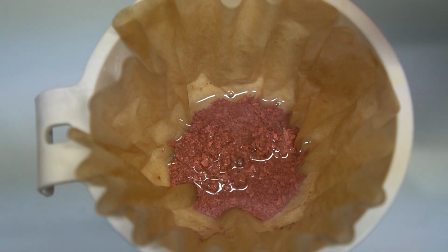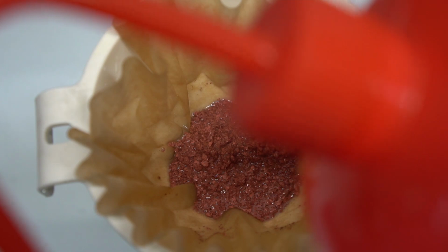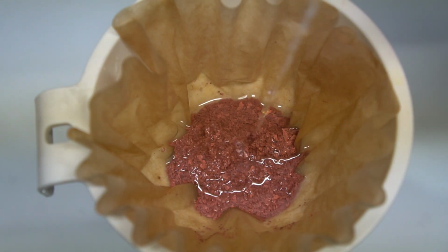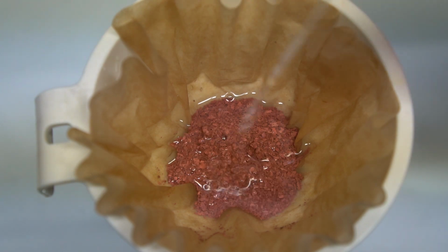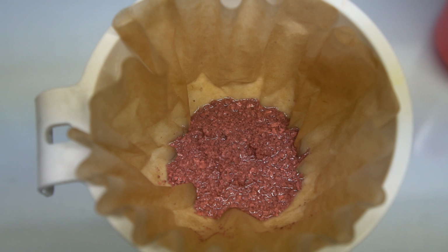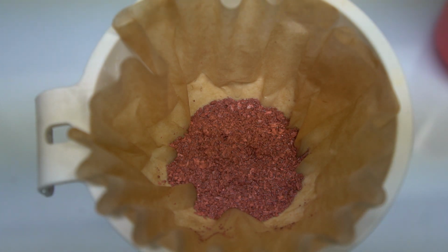We're going to end up with, this is my trusty bottle of distilled water. I could not live without this bottle. And I think that should do it. That should get all clean. So now let's let this settle in here for a minute, let the water drain out, and then we're going to scoop it into a watch glass and admire it.